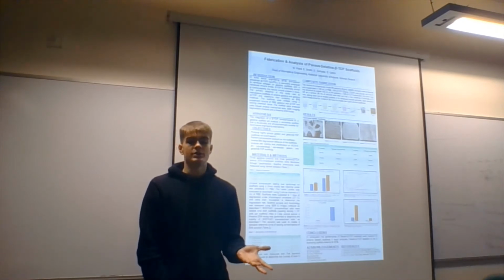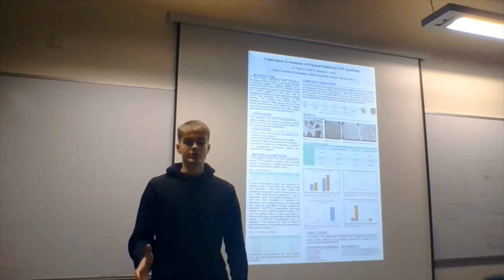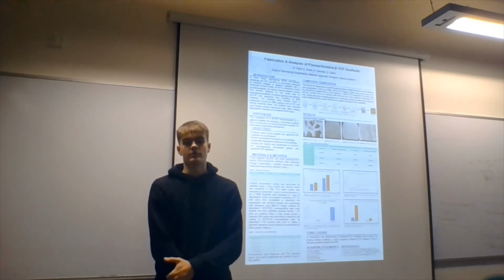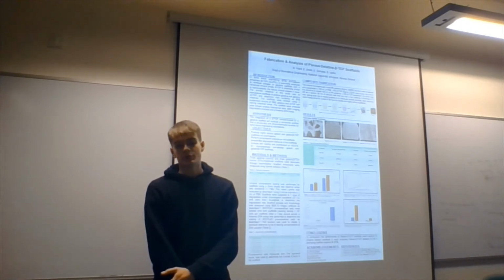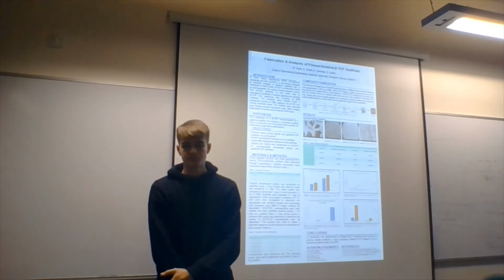To analyze cell viability and proliferation on both gelatin and gelatin with beta-TCP scaffolds, they were seeded with MC3T3-E1 pre-osteoblast cells with a seeding density of 10 million cells per scaffold. After a 7-day culture period, a Hoechst DNA assay was performed to determine the density and therefore the viability of the seeded cells through the recording of their fluorescence.